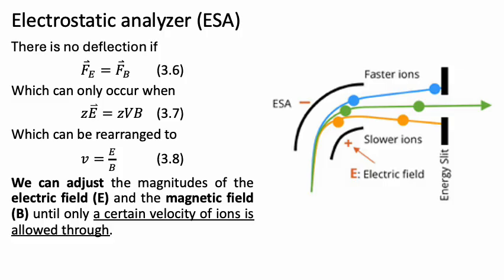So each step that we have an analyzer and a slit or an accelerator, something isn't getting through. So it's important to tune all of these in such a way that you let as much through of what you want to analyze as possible, otherwise no ions of the isotope of interest actually make it to the detector at the very end of the mass spectrometer. And in problem 3 in the homework, I'll have you change the position of the slit so you can see how that affects what gets let through.